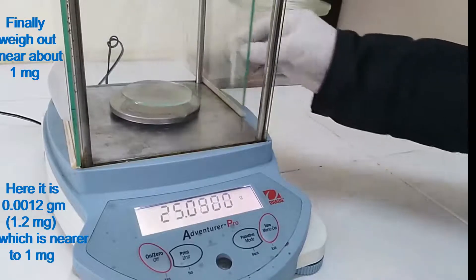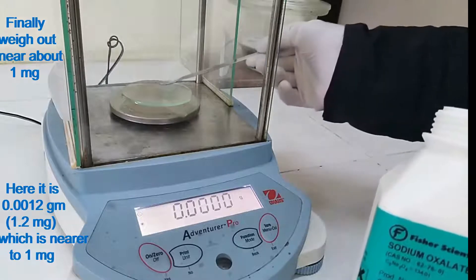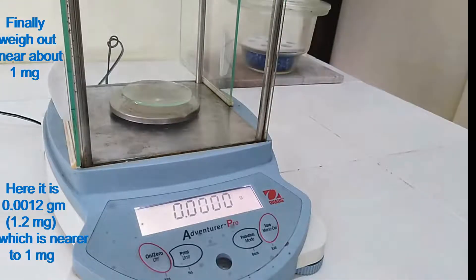Finally, weigh out near about 1 mg. Here it is 0.0012 g, i.e. 1.2 mg, which is nearer to 1 mg.